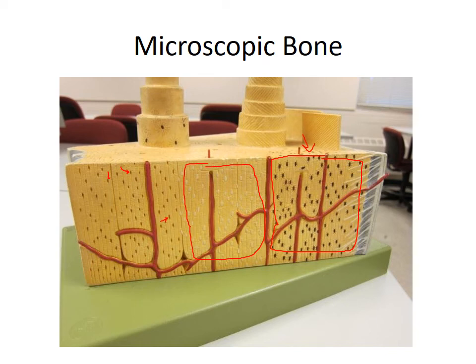the little hollow openings that the osteocytes live in. Now over here you can see what I was talking about with those Sharpey's fibers, those little white fibers that are holding the periosteum onto the outside of the compact bone. And then up here you can see one of the raised up lamella that's on the outside. You can see one behind it here. I'm going to move to the next. Oh, while it's on this, you can see the perforating canals. These little guys here are the perforating canals. The ones that are going up and down, those are going to be the blood vessels that are in the osteonic canals or the central canals.